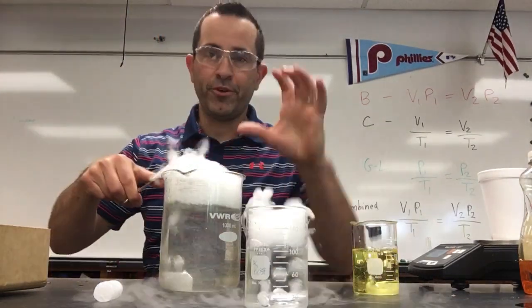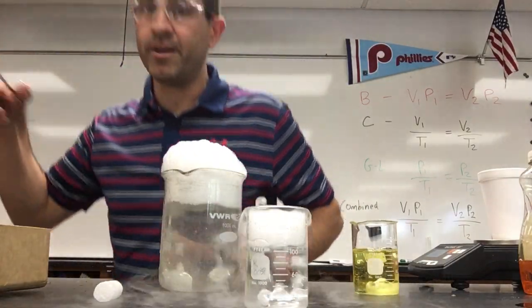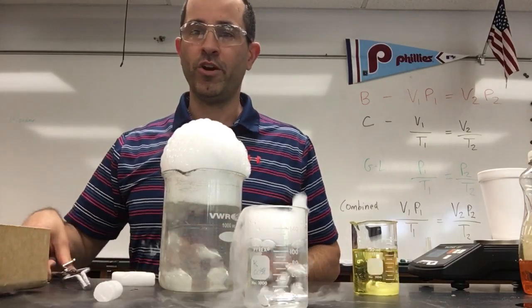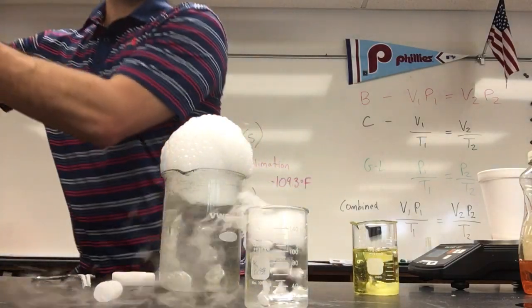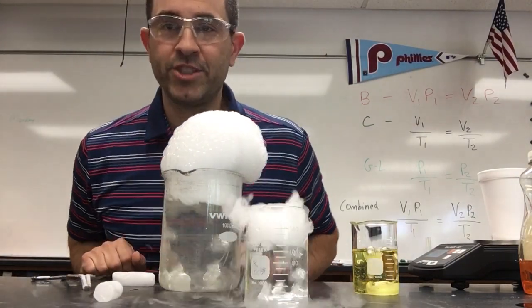Normally I've got a Philadelphia Eagles winter glove, and I forgot to bring it in today. I've got to bring it in tomorrow for lab day. So check that out, pretty awesome, right? We are basically making soapy bubbles. So this makes personal hygiene fun right here.